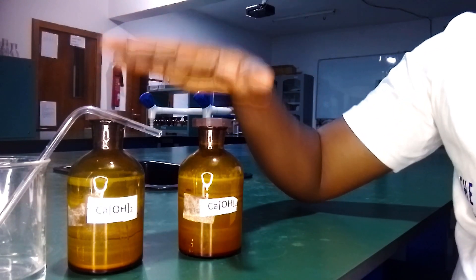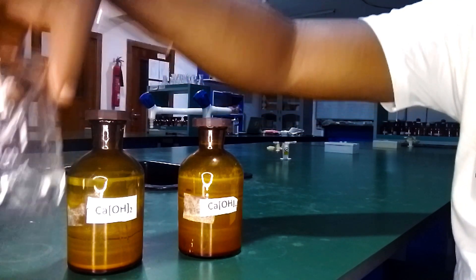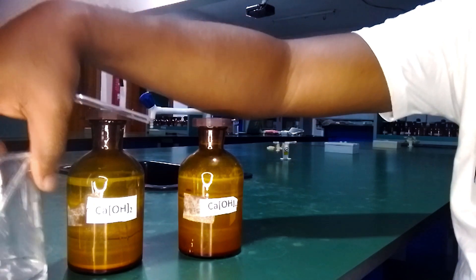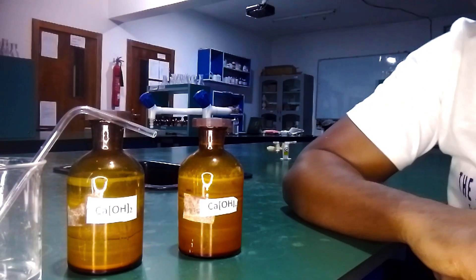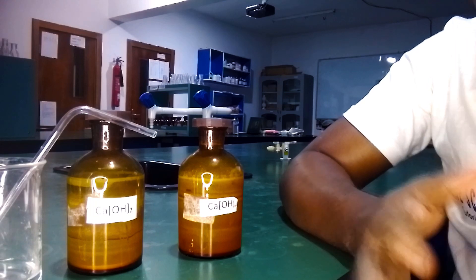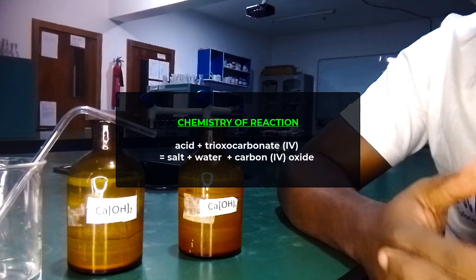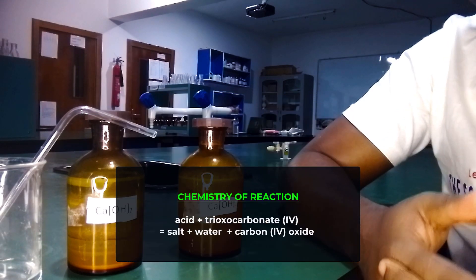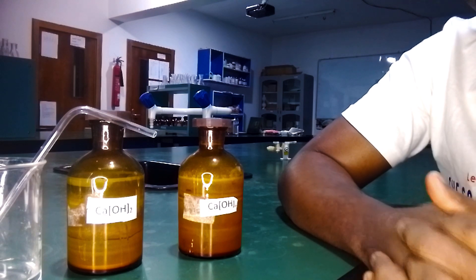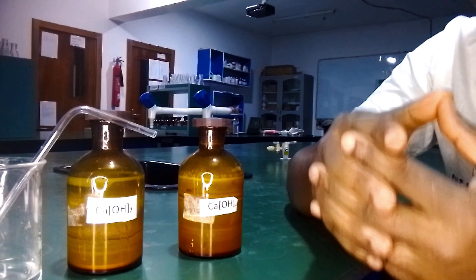We are going to carry out this experiment using lime water — this beaker contains the solution of calcium hydroxide, or lime water — and of course our delivery tube. Carbon dioxide is normally prepared in the lab from the action of acids on carbonates, but in this case we are not going to use that method.